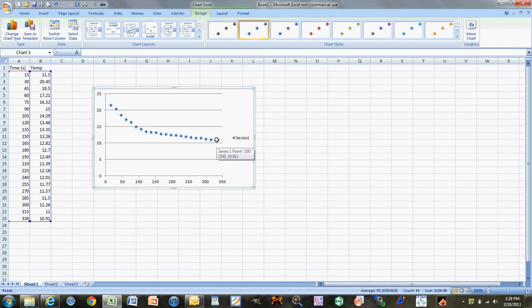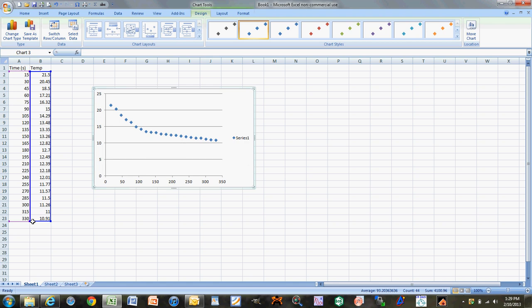This is some made-up data, so I'm going to use this point right here. Notice it says 120 seconds — you can see that where I have the cursor over that point, the x-coordinate says 120. So I'm going to highlight these boxes and drag the selection back up to 120 seconds, which takes me from time 0 to 120 seconds.